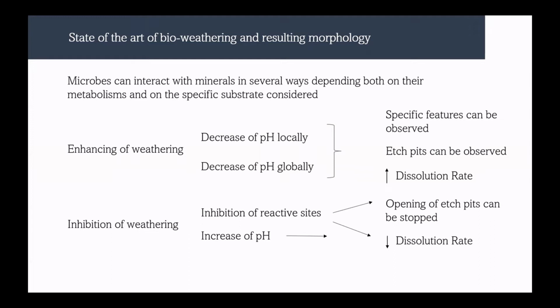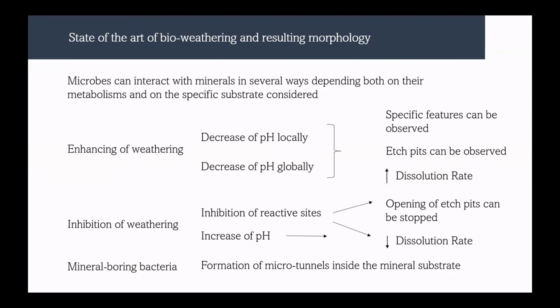And so in both cases, we could have an inhibition of the growth of etch pits, and overall we expect a decrease in the dissolution rate. Lastly, there are some specific bacteria that are able to actively bore into minerals, and so for this kind of bacteria, the surface features that we can see are some microtunnels inside the mineral substrate.